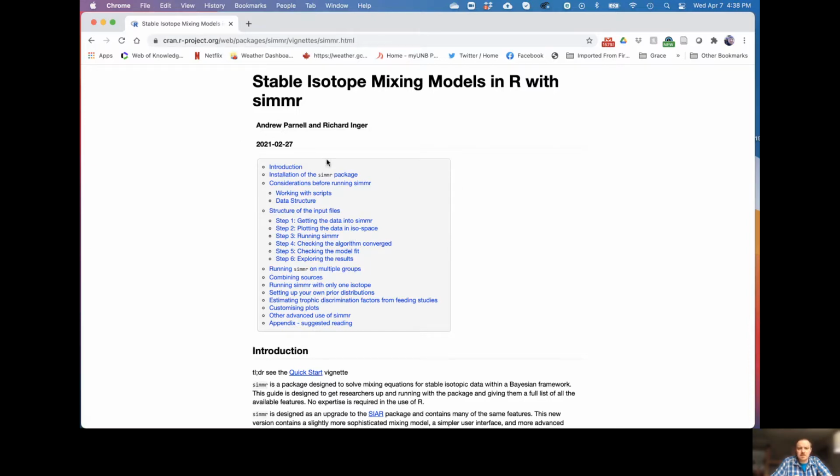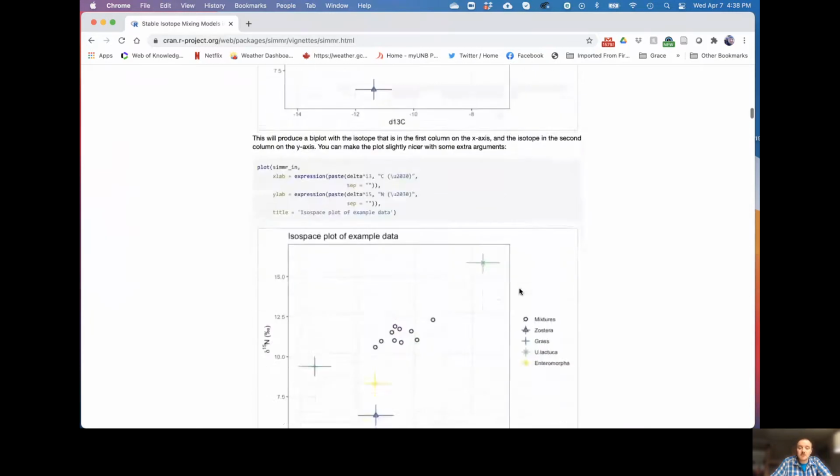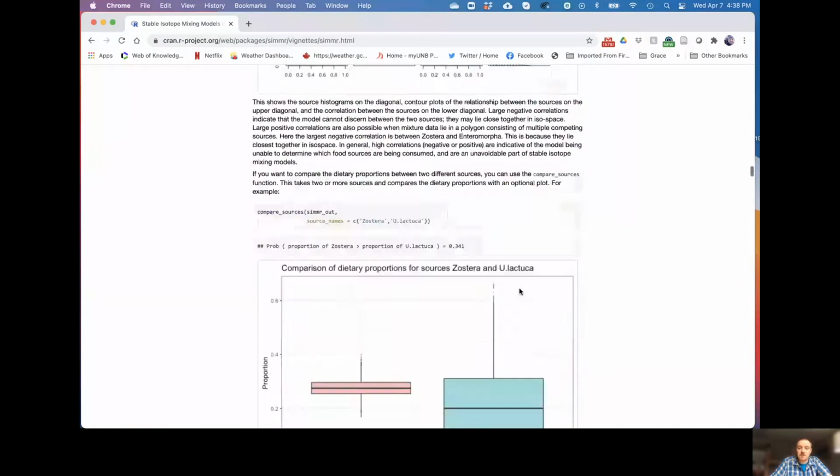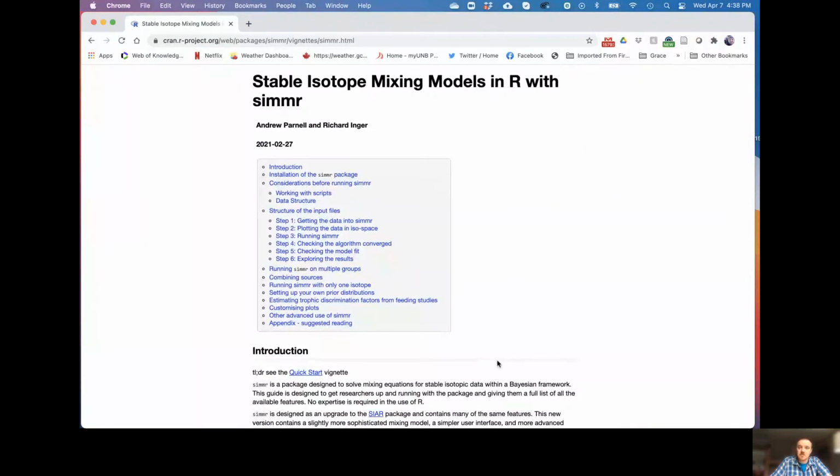You'll see they keep it pretty up to date. It's almost like a README, but with a lot of worked examples, an absolute treasure trove of information about these packages. And everything you need to do with these packages, these guys have shown you how to do it.